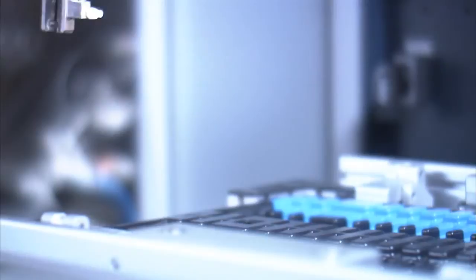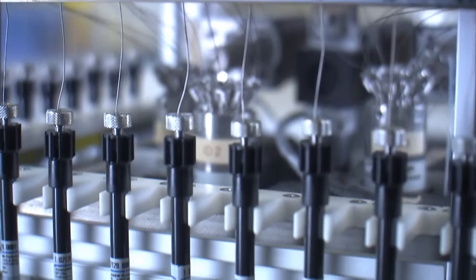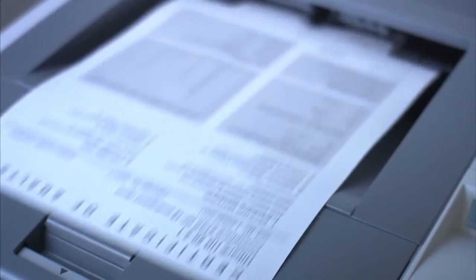We test every individual product's quality using the latest HPLC equipment and modern analytical methods. Finally, each column is packed with a certificate of analysis, including a test chromatogram.